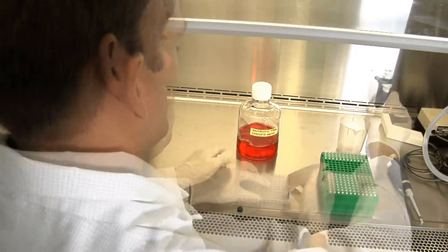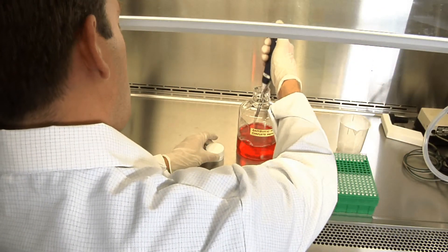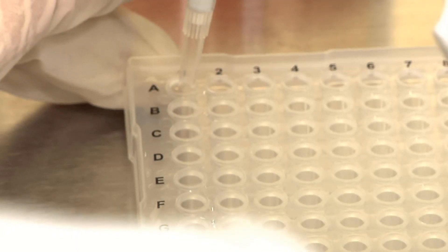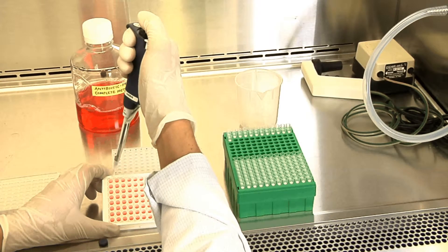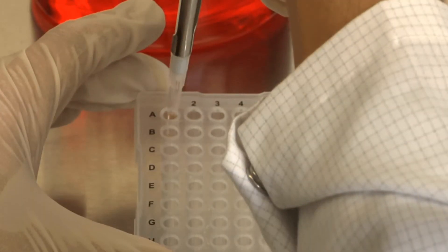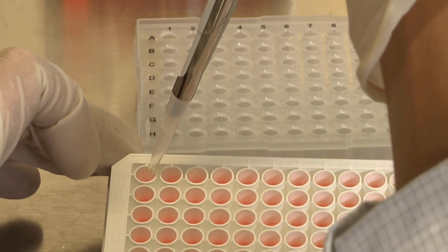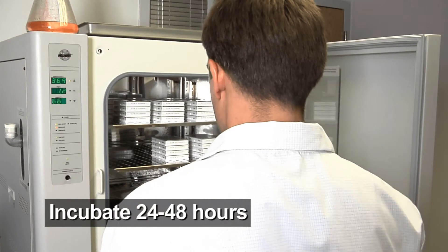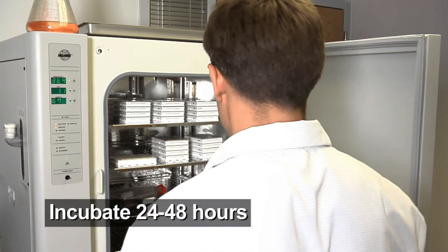After incubating, add 80 microliters of pre-warmed, antibiotic-free, complete media for a total volume of 100 microliters per individual well, resulting in final mimic concentrations between 10 and 50 nanomolar. As a final step, carefully remove the media from each well of seeded cells and replace with 100 microliters of the appropriate final transfection mixture. Return the plate to the incubator and incubate for 24 to 48 hours. Most mimics will produce significant results within 24 hours.